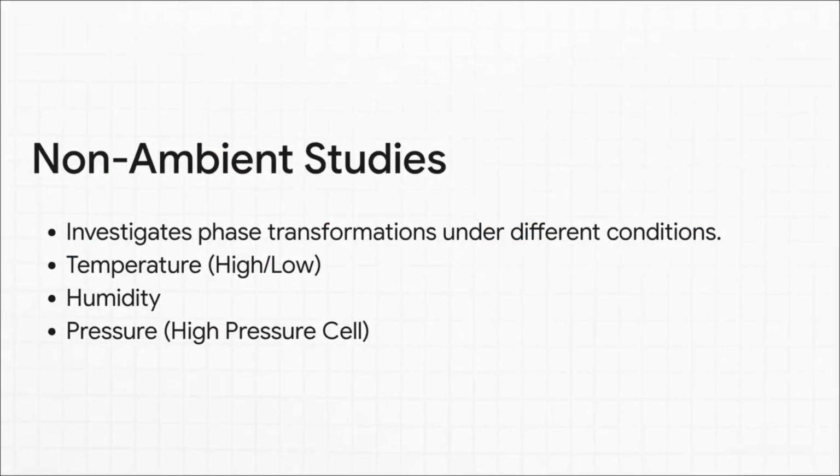But wait, what happens when things get a little chaotic? Because materials in the real world aren't just chilling in a perfect climate-controlled lab, they are exposed to some pretty extreme environments out there, and that is exactly where non-ambient studies come in. See, XRD doesn't just stare at static materials sitting at room temperature. It can actively watch how those crystalline phases transform when we crank up the intensity. We can investigate what happens when we drastically raise or lower the temperature, mess with the humidity, or apply immense pressure using a high-pressure cell. We can literally sit there and watch structural phase transformations happen in real time under stress, which is just mind-blowing.